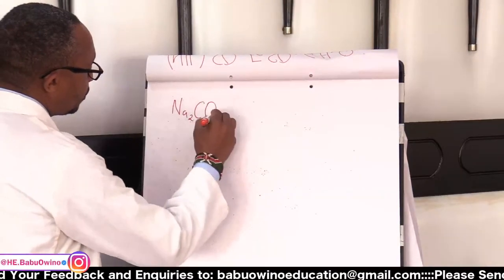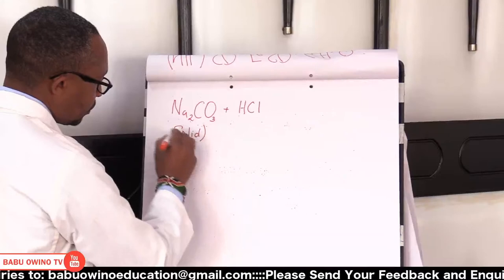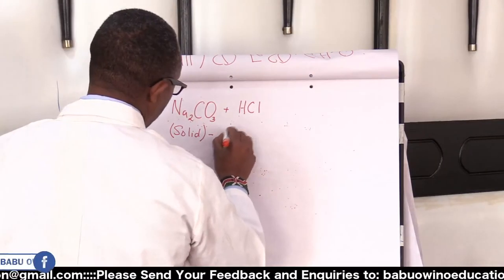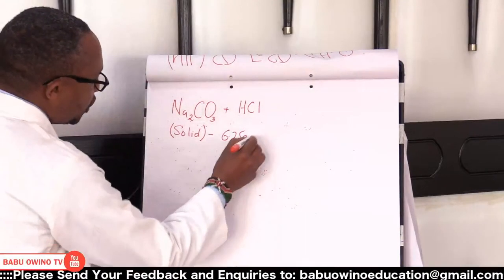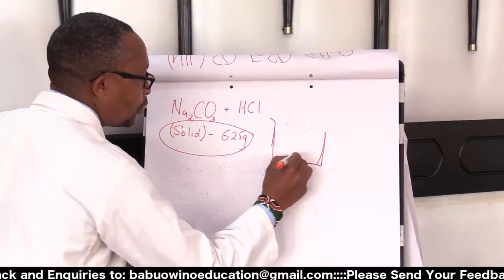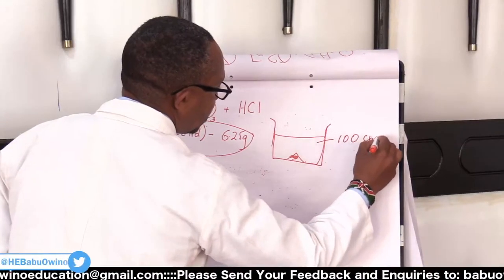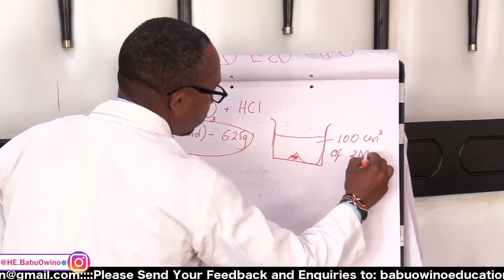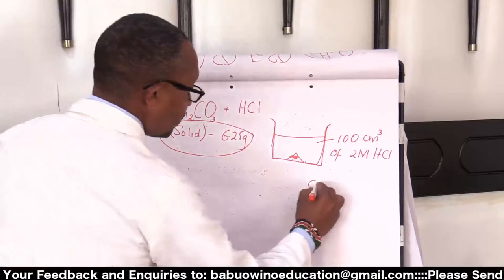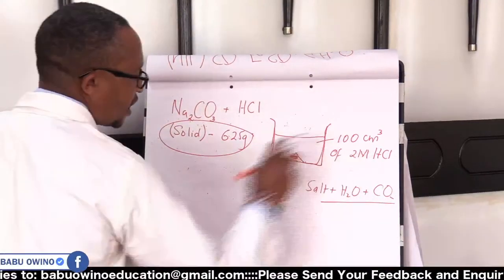As I wind up, reacting with HCl, you are given a solid. And this solid could be, let me use values that I have worked out, maybe 6.25 grams. You put this solid in a beaker. So you put your solid here. Then you are given 100 centimeters cubed of 2 molar HCl. So a carbonate and an acid combine to give you a salt, water, and CO2.